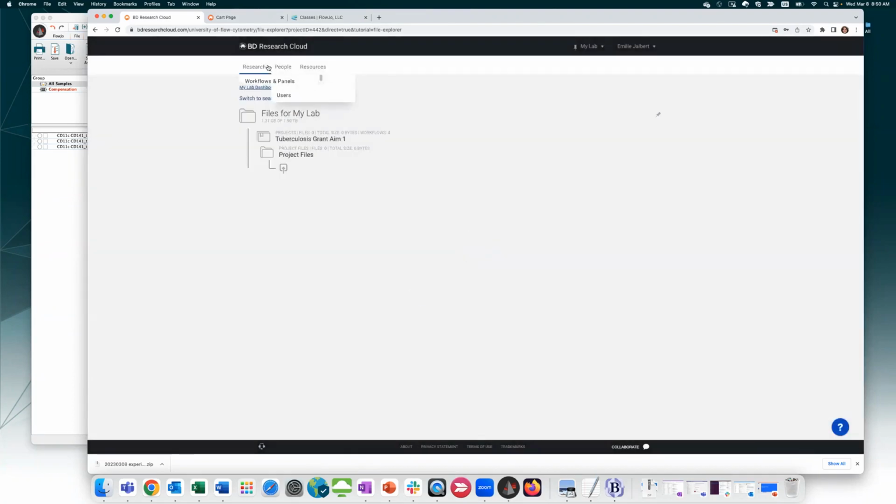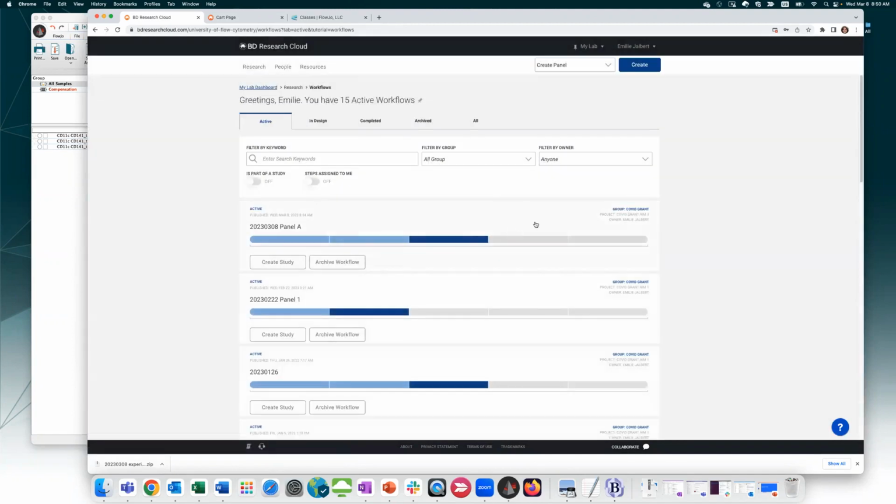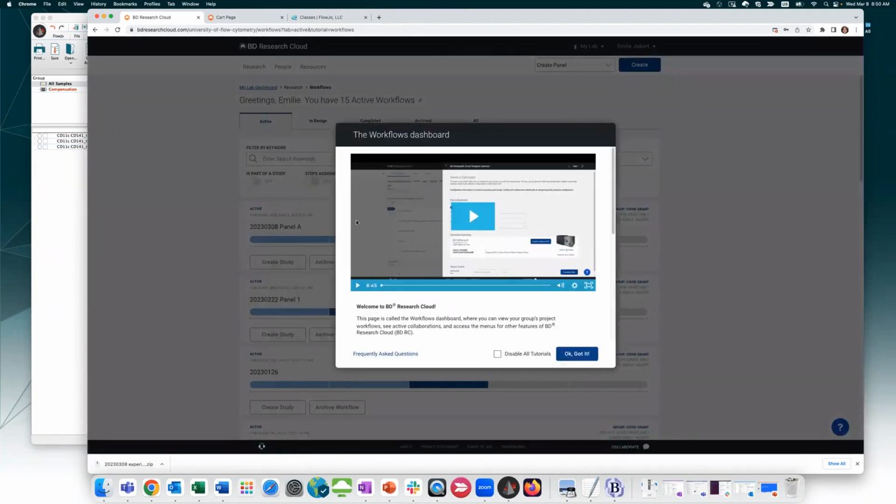And then on the main web page, when you first log in, there's a little intro video that starts up. I recommend you watch it. Kind of gets you oriented, as we did today, about the different features and functionalities. So that's about it. That's what I had to discuss today. I'm happy to take any questions.